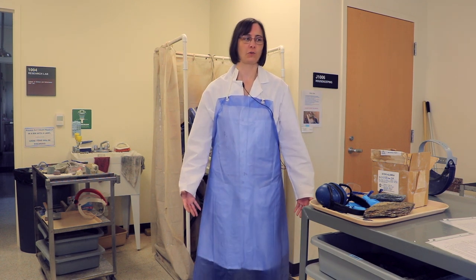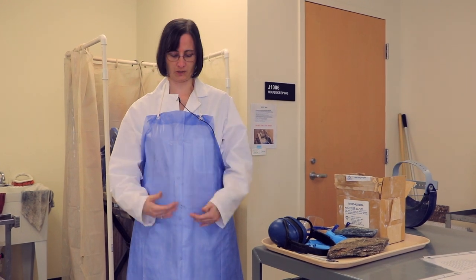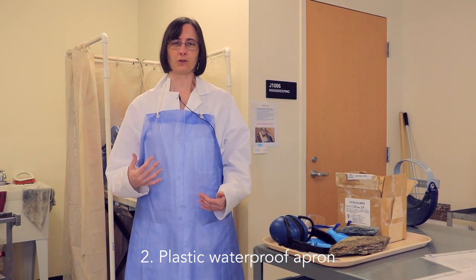Hi, this is Dr. J and I'm here to talk about safety gear for the rock preparation lab. You can see that I'm wearing a lab coat, and if you don't want to get soaking wet, then you need to have some kind of protection for the front of your body so that it doesn't soak your clothes.